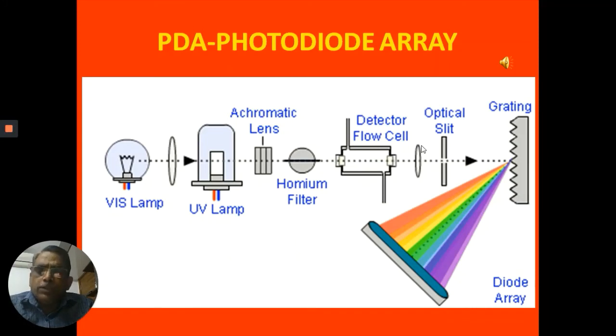These photodiodes can also be used as an array detector. So you can organize them as an array, which finds a lot of application in the spectral measurements. As a one stroke, there is no movement of grating required. So you disperse the light with a grating onto the array elements. So that really facilitates the faster measurement of the spectrum that you are looking at. For example, if you are looking at an absorption spectrum or an emission spectrum, you don't have to scan it. In 100 milliseconds, you can get the entire spectrum that you are recording.